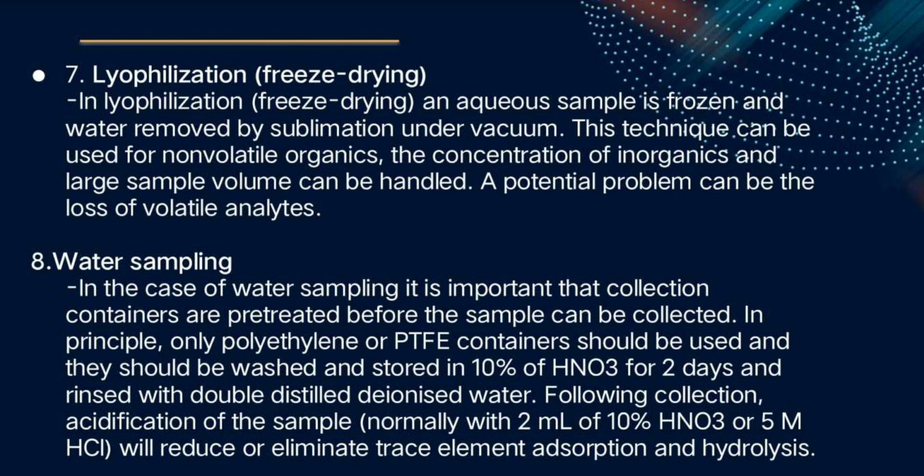Freeze drying is a process in which water is removed from a product after it is frozen and placed under a vacuum, allowing the ice to change directly from solid to vapor without passing through a liquid phase.